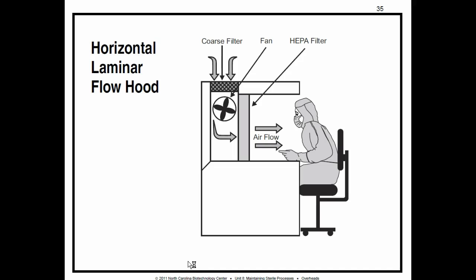The figures that follow show cutaway views of two types of laminar flow hoods: horizontal and vertical. In a horizontal flow hood, the air gets filtered in and blows back out the front. Notice there's no sash — no window. This is intended to protect the material, not the person. Anything that could blow off the material you're working with will blow back toward you.